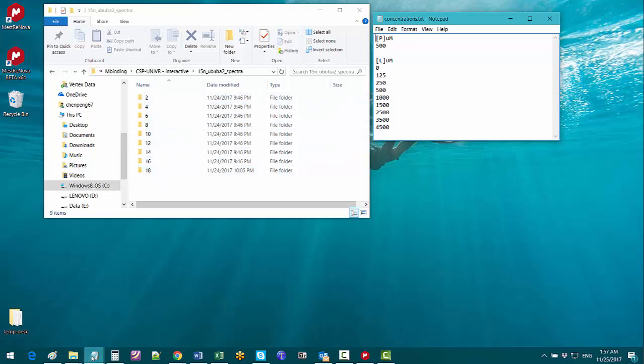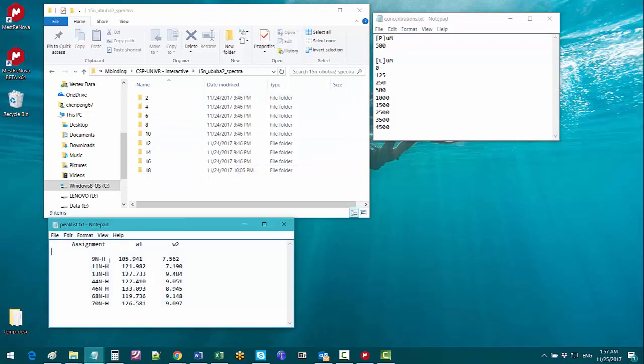In this text file we have the seven peaks that we want to follow the chemical shift changes, measure the chemical shift perturbation and fit the dissociation constant for each of them. Eventually we will calculate the average KD.